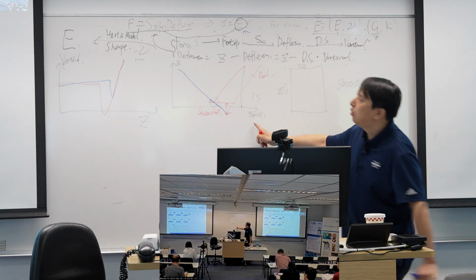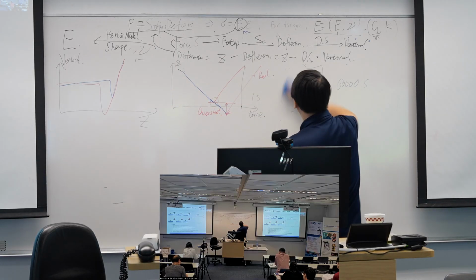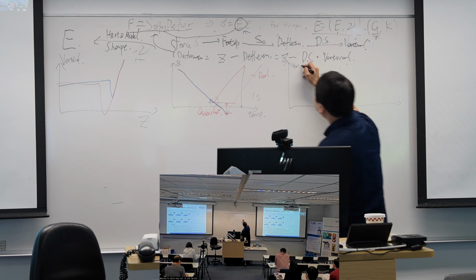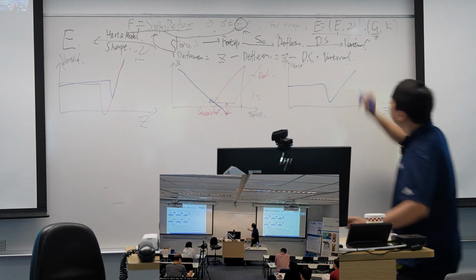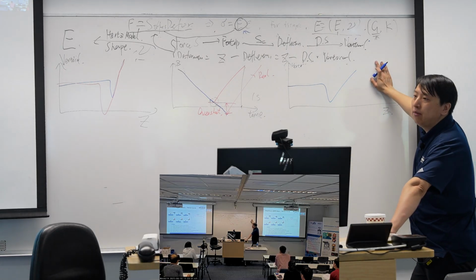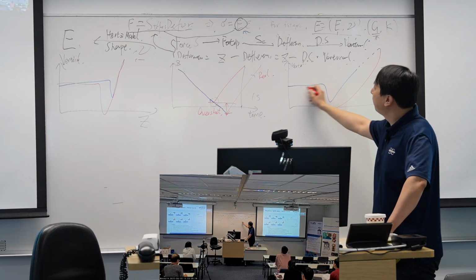That's the z movement, and then when you change it into vertical over z, our idea is we want our probe to turn around at this point, but as we said, it will have the overshoot, so the probe will keep going, and after a while it can go back.